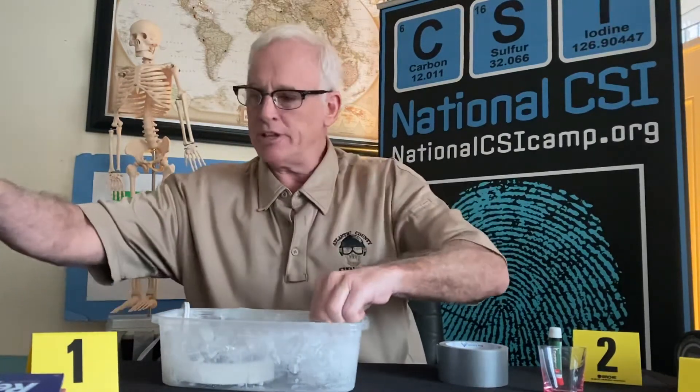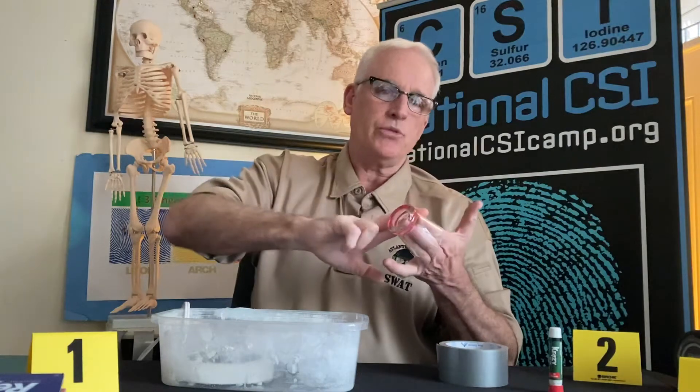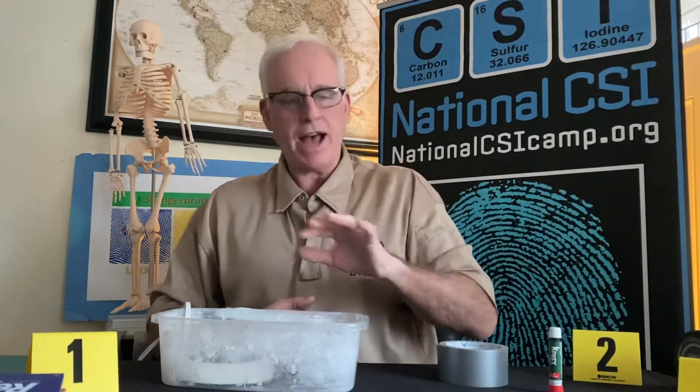In the small container there's already a little water — add a little bit more water to it. We have the item that's going to be fingerprinted. We're foregoing gloves and a mask since you're at home, so try not to get your fingerprints on the surface other than the ones you're trying to capture. You actually have more oils on your forehead or the side of your nose — rub your fingers there and place those fingerprints on the shot glass facing the heating element.